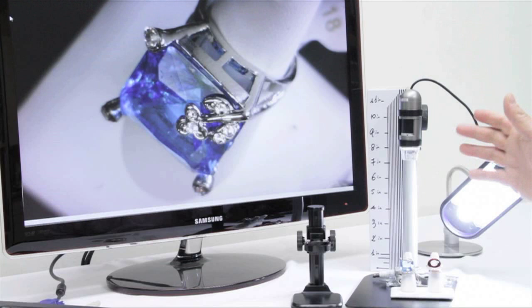The magnification ranges from 10 to 220 times with both scopes.